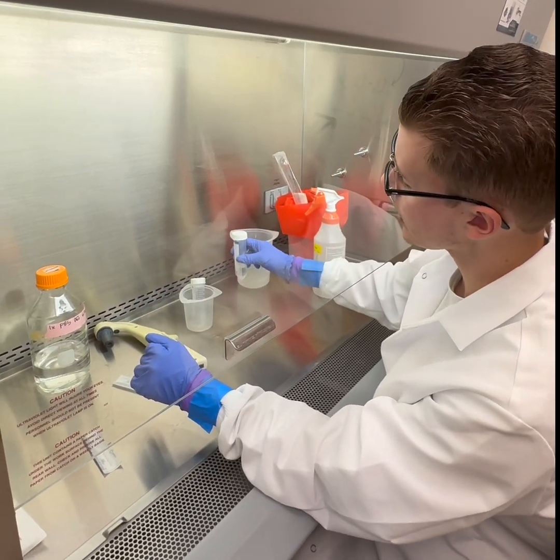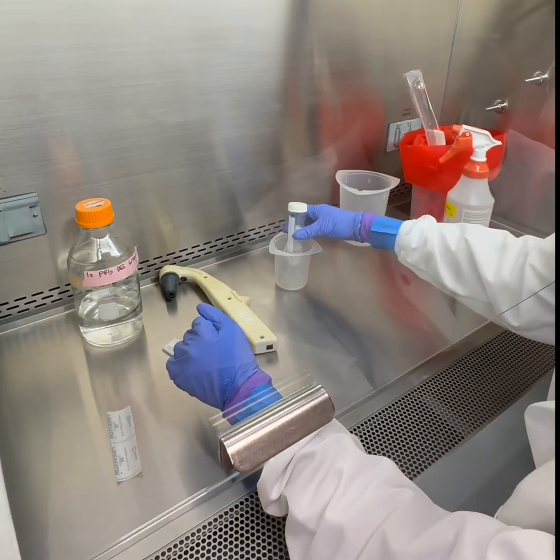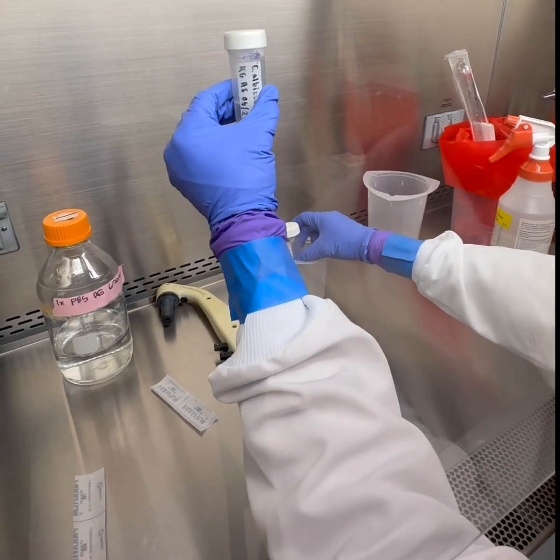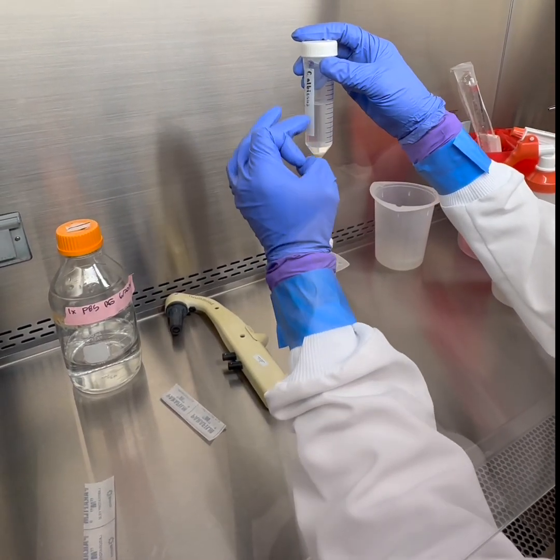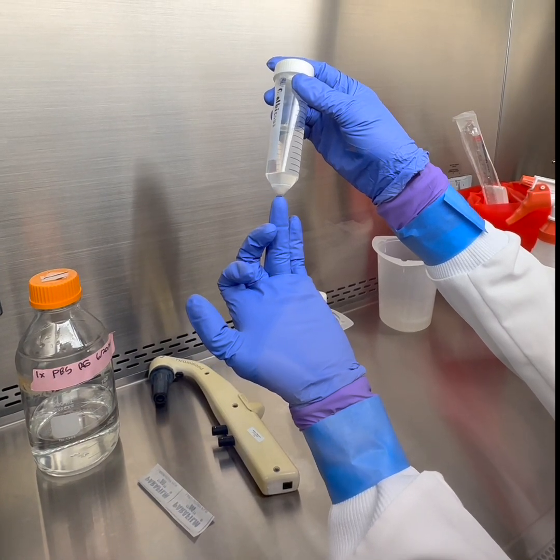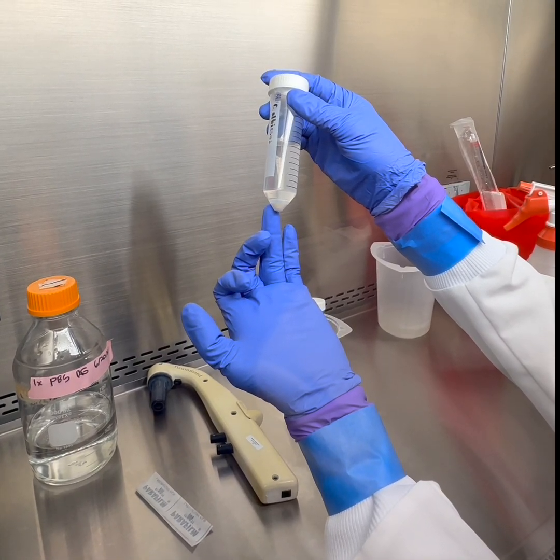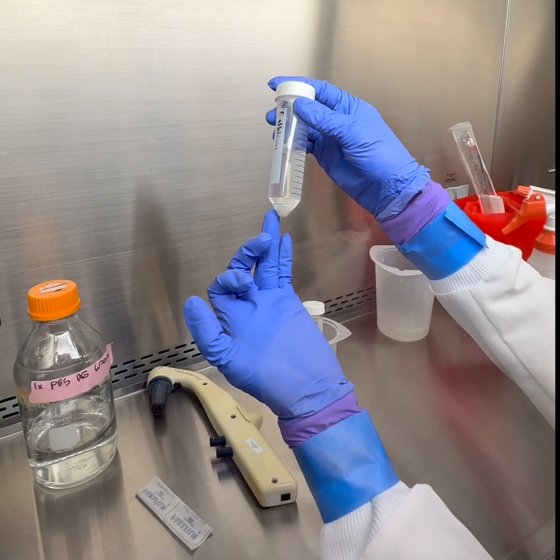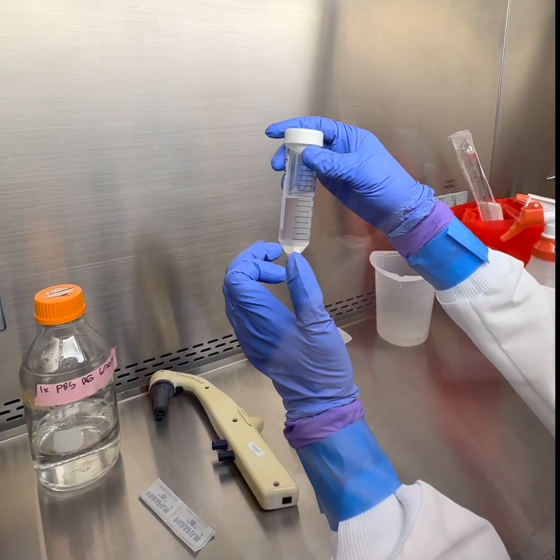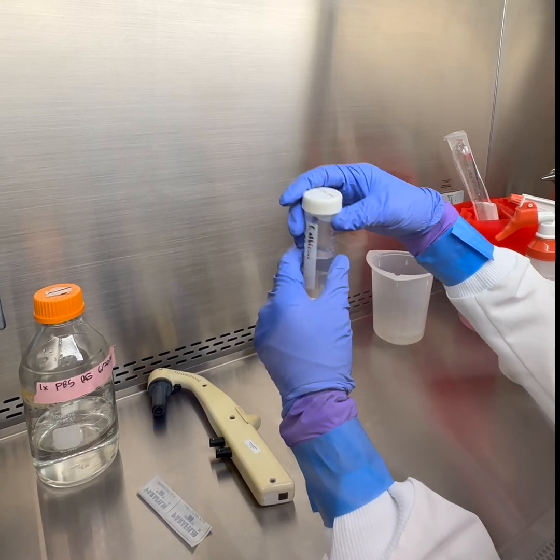And so what we've done is we've spun it down. So you'll see here, this is our culture. Originally there was broth in here. We've spun it down, and you can see there's a pellet right there of cells. It's pretty tightly packed. We did 3,000 Gs for 10 minutes. And then on top is PBS. That's what we're washing with, phosphate buffered saline.